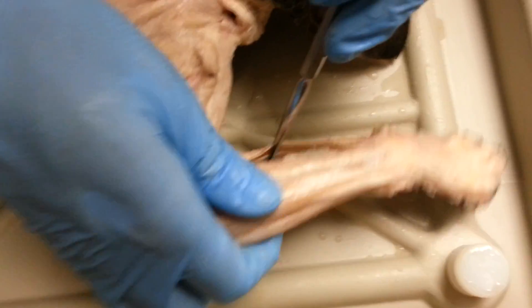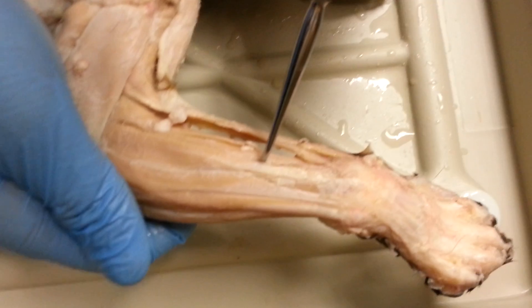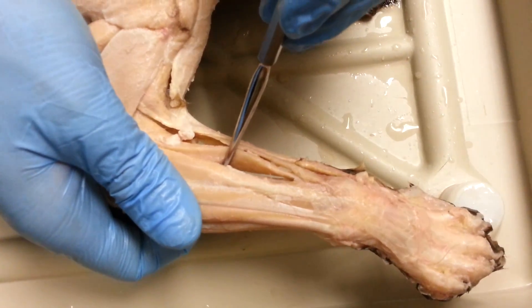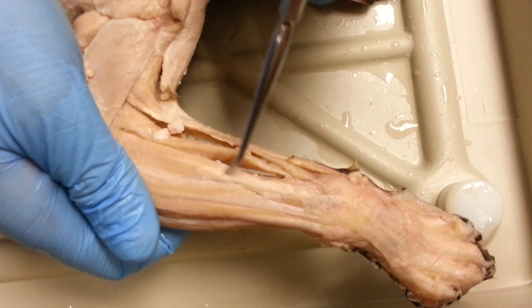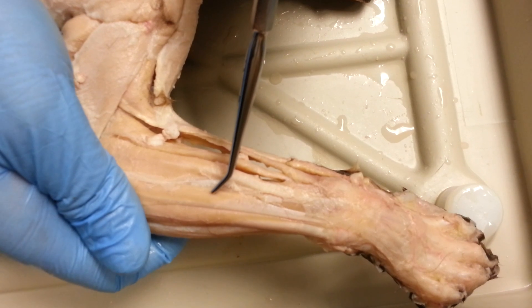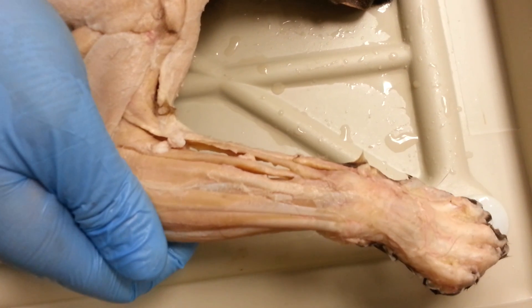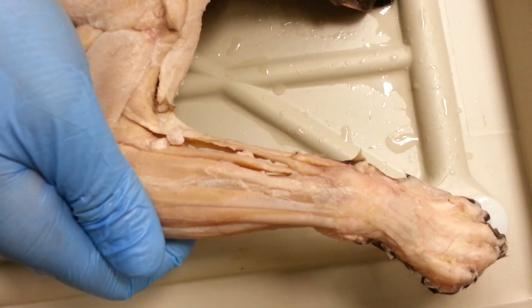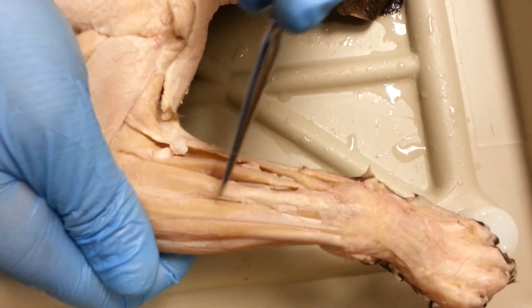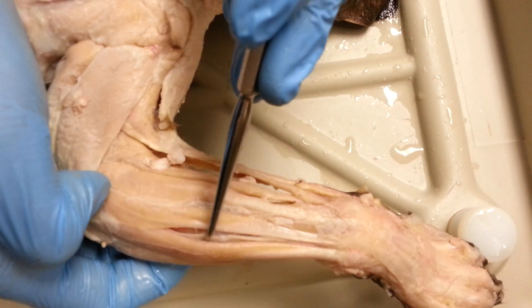This is our brachioradialis. Then this little one here is actually a two-headed muscle — extensor carpi radialis longus. This one is extensor digitorum communis. This one is extensor digitorum lateralis. And then this one right here, right on the ulna, is extensor carpi ulnaris.